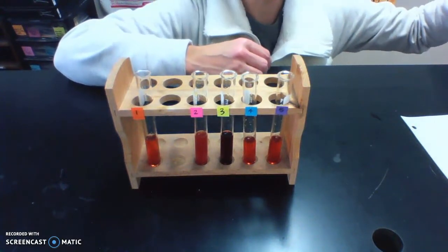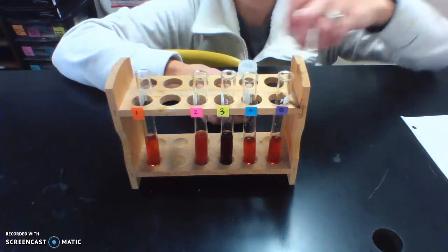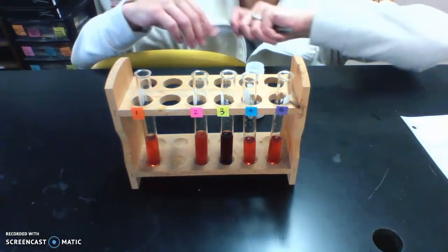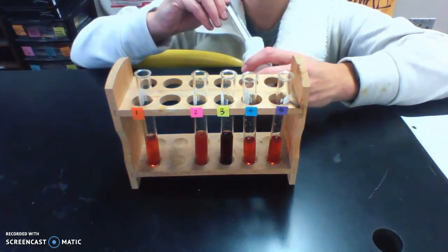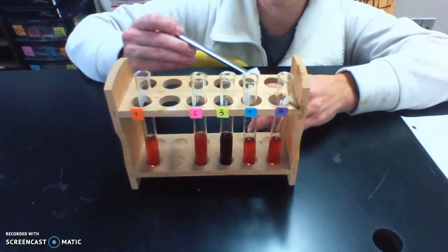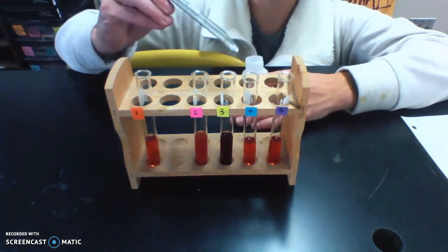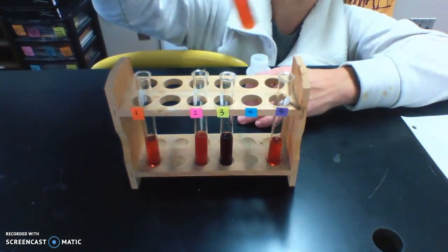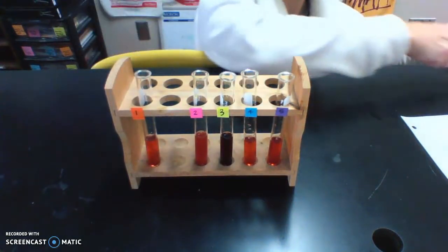Let's add now potassium chloride. Let's see if the potassium has any part of it, right? Or the chloride even, right? Because we had iron and chlorine, and we have potassium and thiocyanate. So let's see if this is any sort of factor. It says to add some solid. Okay, so a few crystals. All right, so this is tube 4. It doesn't look like any change, so it doesn't look like this does anything.